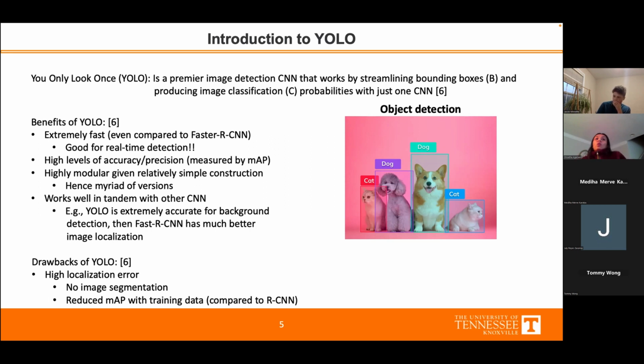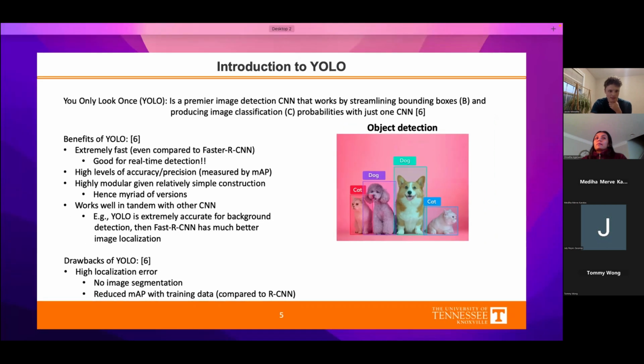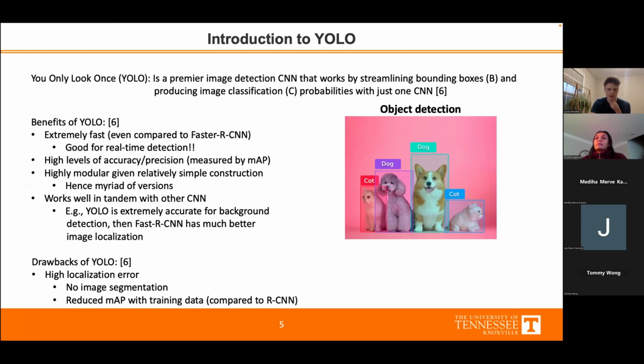Another general question is why YOLO is called YOLO? You only look once. What does that mean? So I believe specifically their inspiration for the name is that your data is inputted and passed through just a single CNN, so they can do all the computations that they need to in order to extract the desired information without necessitating the need for more complicated multi-stage CNNs.